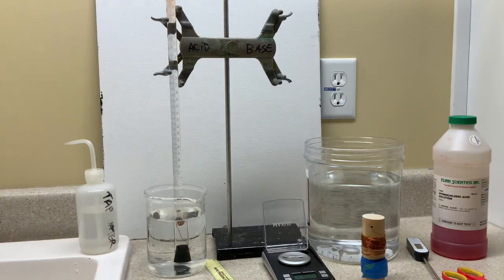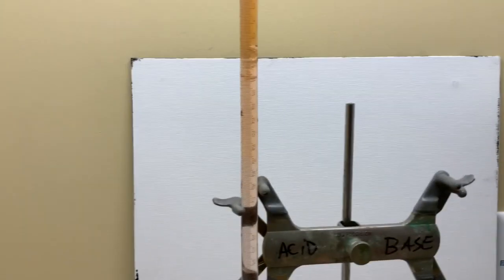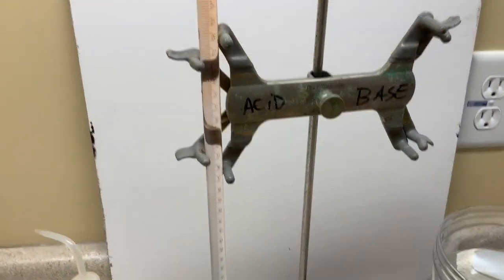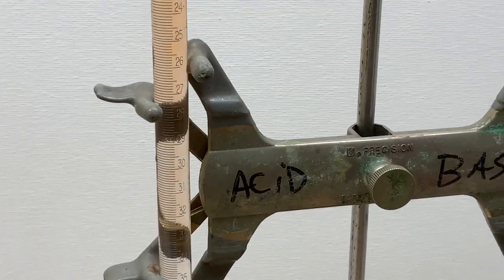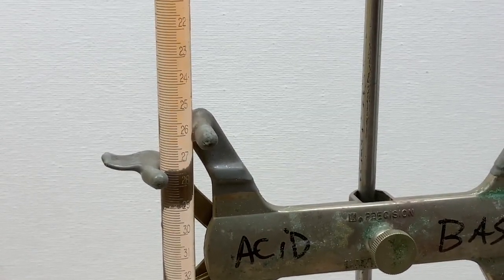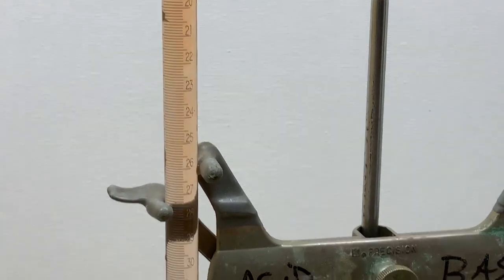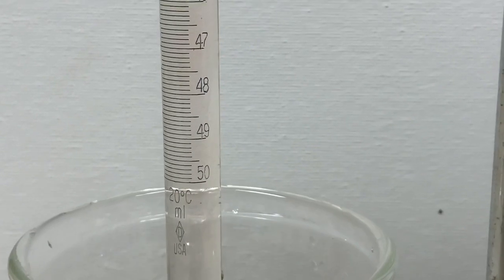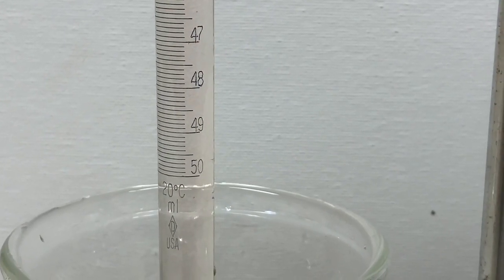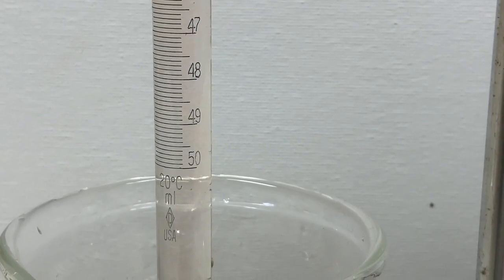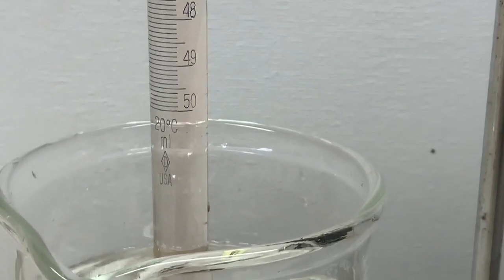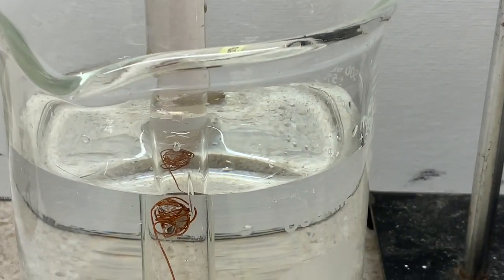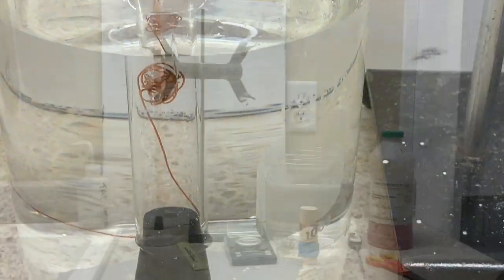I think if you look closely you should be able to see the acid as it drifts down through the water to make its way towards the magnesium at the bottom. Again, that acid slowly making its way down towards the magnesium at the bottom. You can just see it wiggling the solution there. And it looks like the reaction is just starting; some bubbles just starting to form.